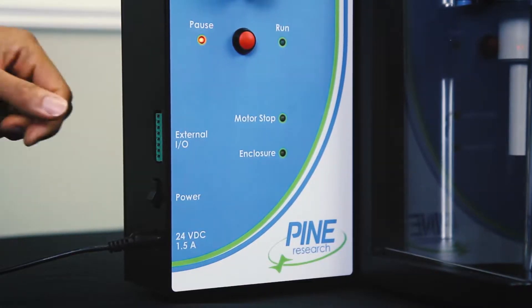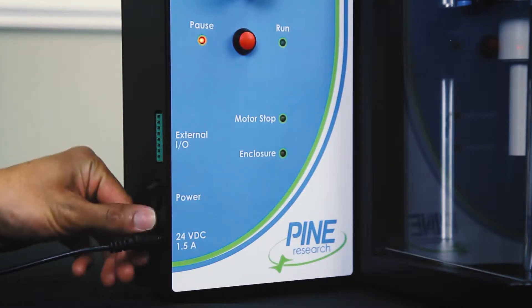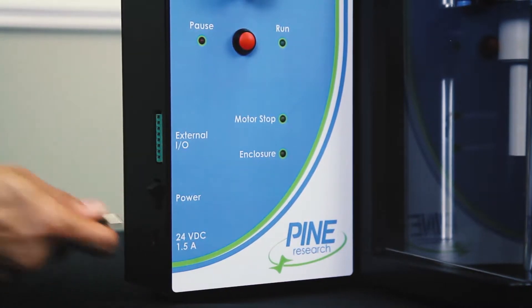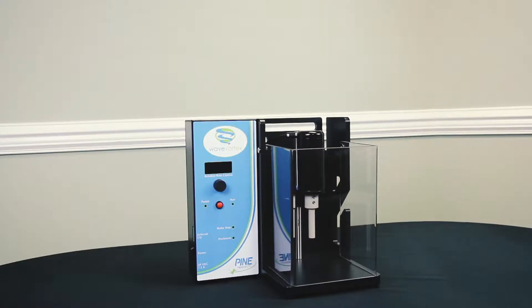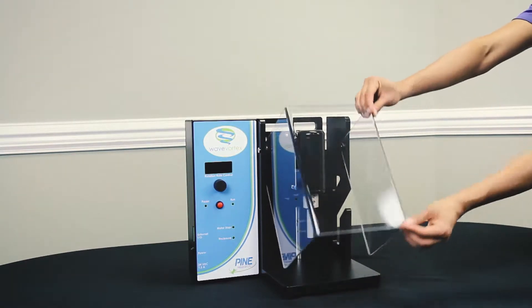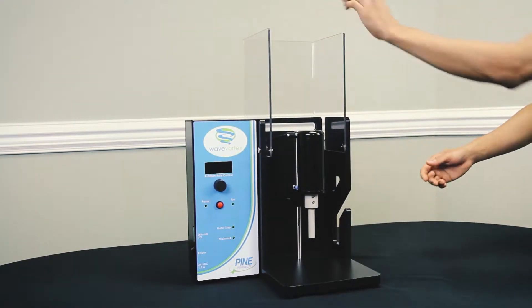First, make sure the wave vortex is turned off. It's easier to work with the enclosure window lifted and the motor unit positioned at the top of the support rod.